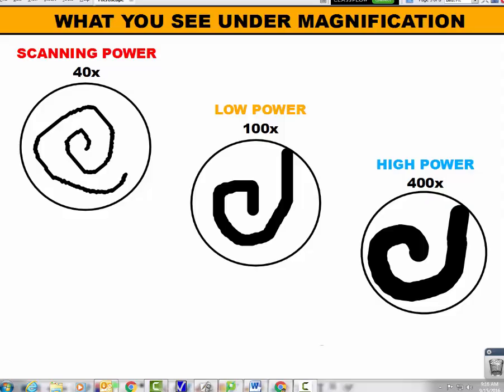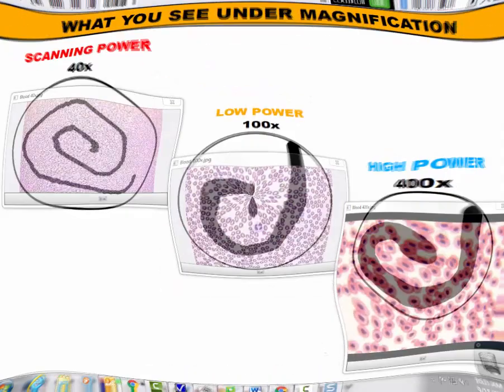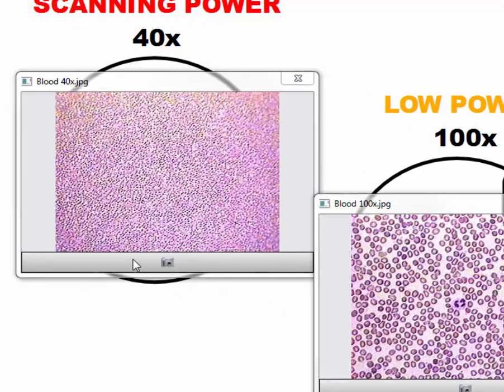Now let's take a look at some examples of blood cells at the different magnifications on the microscope. At the top left here we have 40x which is 40 power which is our smallest magnification. Since it's our smallest magnification, our images are going to be smaller and we're going to see more of them and more of the field of view. So that's why you see a lot of small dots.